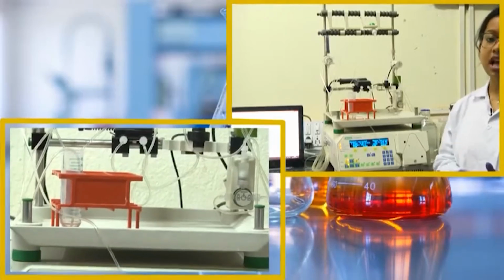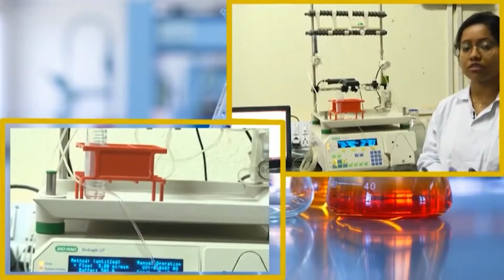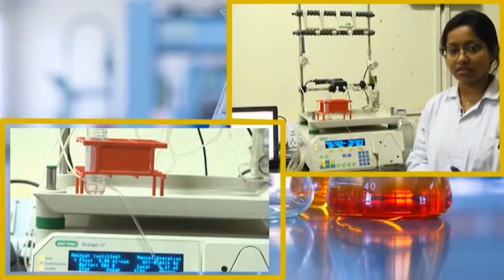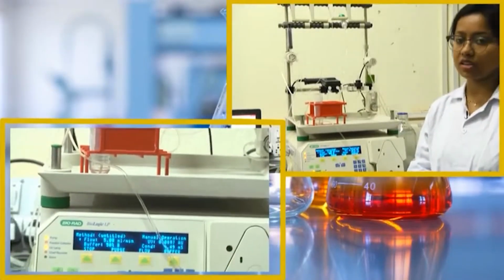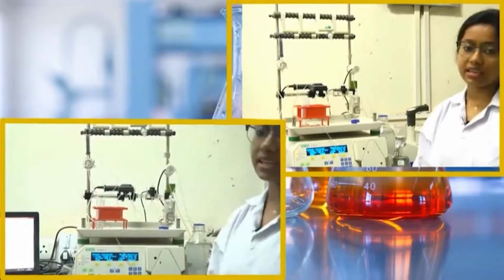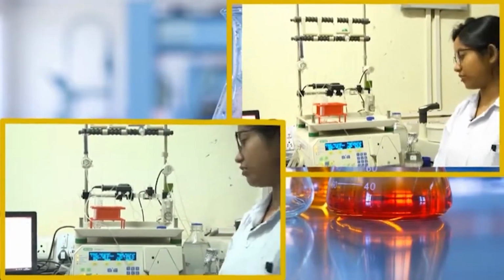If you do not have any histidine tag in your protein, then you have to go for different kinds of methods. There are other methods which you can follow, such as ammonium sulfate precipitation. But here, as we have histidine-tagged molecules, that is why we are using this particular method. So, we have been running water through this FPLC system for the past 10 minutes at a flow rate of 5 ml per minute.